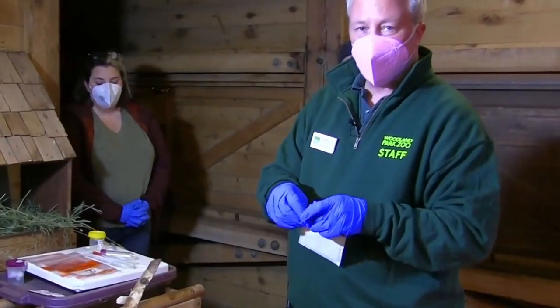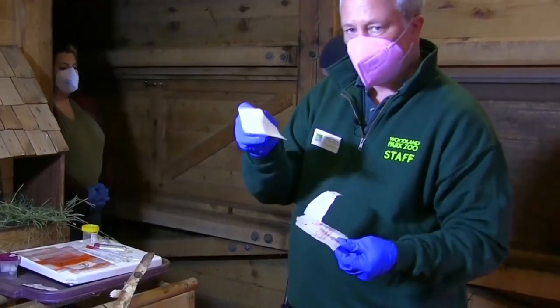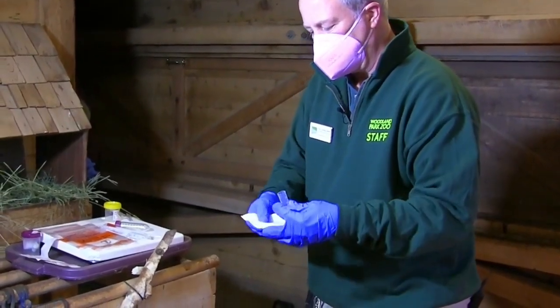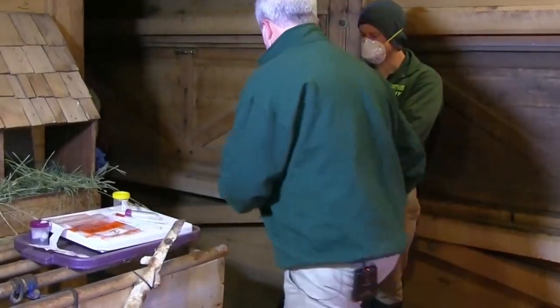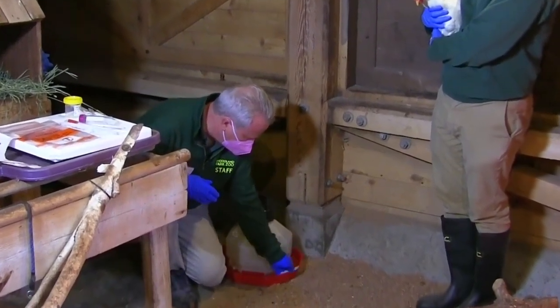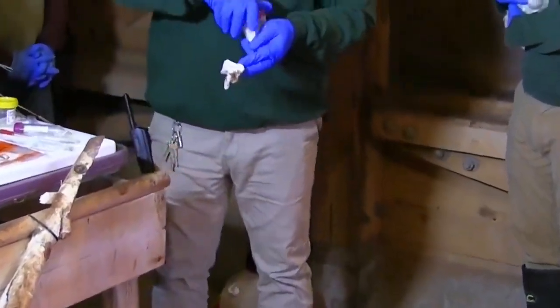Next, I'm going to take a sample of the water bowl. Again, a sterile gauze square. I'm going to moisten that with the sterile solution. I'm just going to swipe the areas where the chicken might have been and contacted, and then put that in my sterile container.